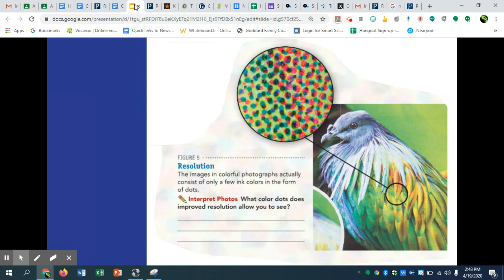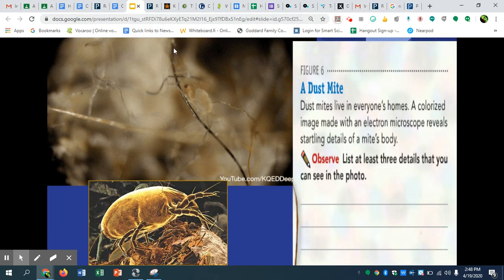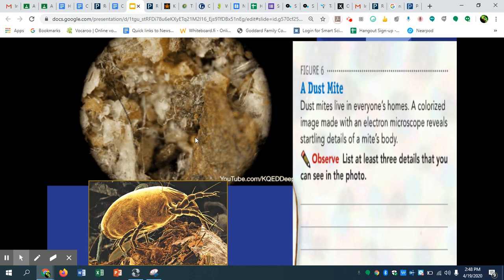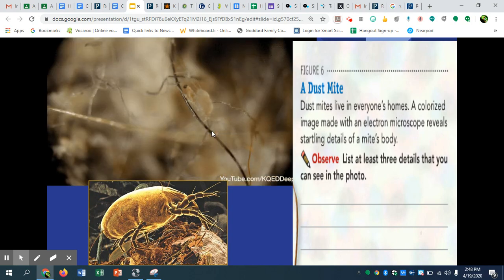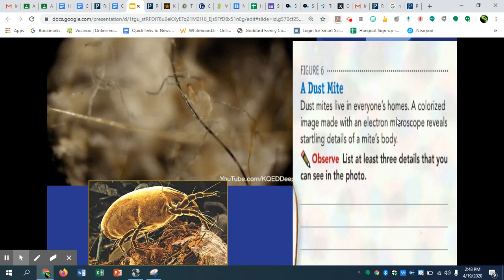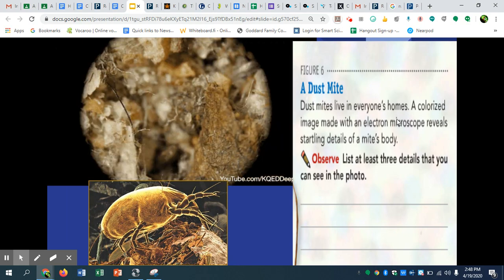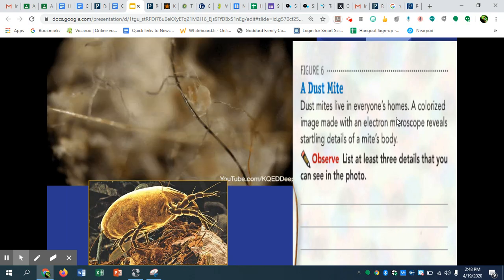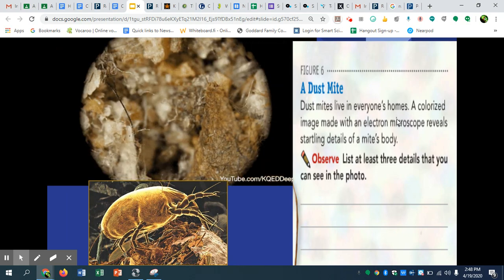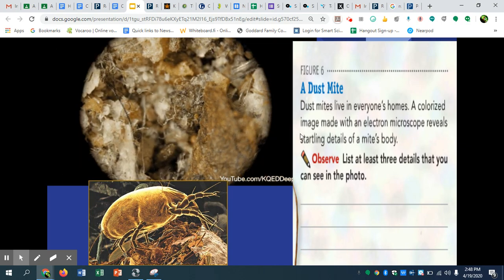All right, let's go down to figure 6. The dust mite. I wanted to show you a little gif of a dust mite. They're so adorable. So dust mites live in everyone's home. And yes, Mrs. Skinner, if you are watching this video, they live in your home too. I know your home is immaculate, but they live in everybody's home. We can't help it. So a colorized image made with an electron microscope reveals startling details of a mite's body.